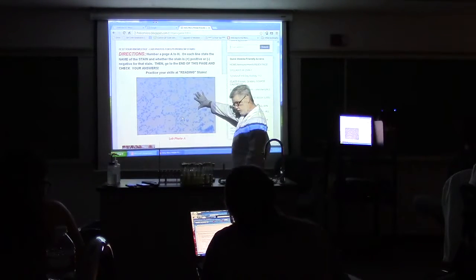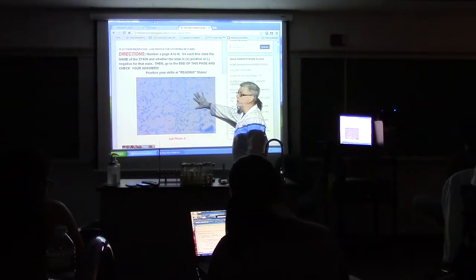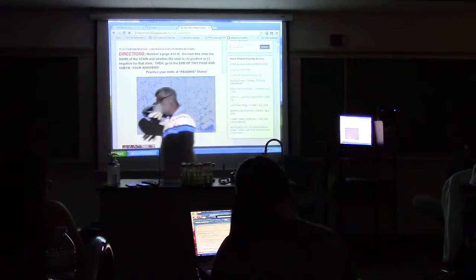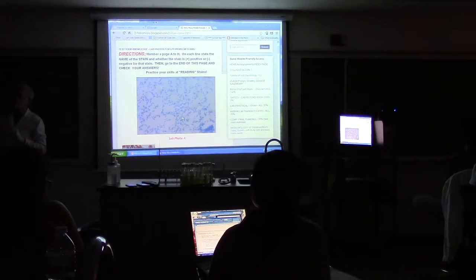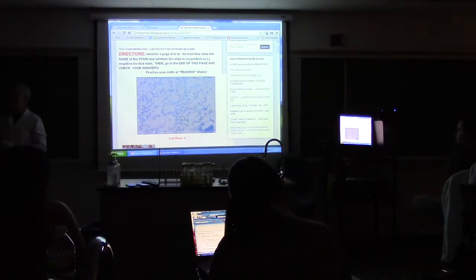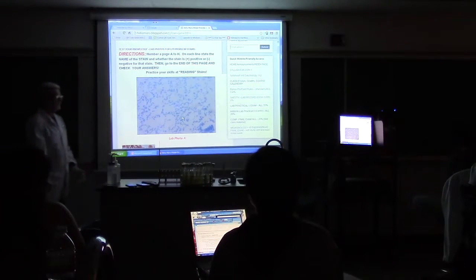So this is E. coli on an acid-fast stain. How do you know? It's baby blue. Now remember, how would you know the stains? Because on the gram stain, your two colors are purple and pink. On an acid-fast stain, they're baby blue and fuchsia or hot pink. And on endospore, it's pink and green. So is that green? No. It's not endospore. Is there pink? No. So it can't be gram and it can't be endospore. So what's it got to be? Acid-fast, because there's only three.